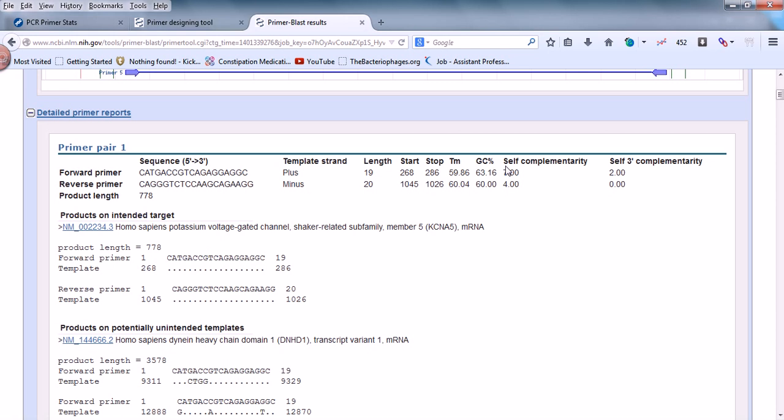We need to check for them, right? So here we go from pair number one to pair number five. Among them, each pair has a forward primer and a backward primer. You need to look for those primers and check whether they will work for us or not. Let's select each of these primers.